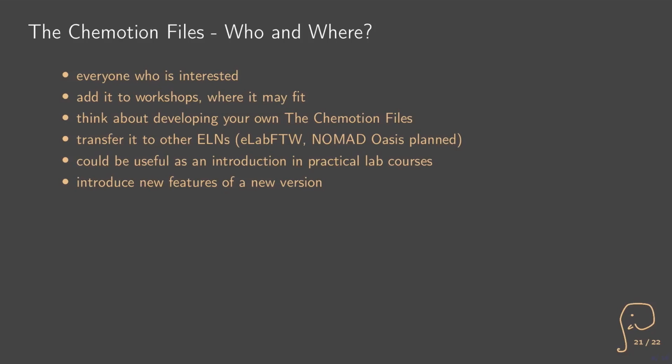What you could do instead is you say, okay, you have to do 10 syntheses. For the next semester, we cut down 1, you make 9, and the last one is actually an example which is already in the ELN, kind of the Chemotion files, right? All the data is there, and then they need to find a specific spectra or download the spectra, make some analysis or something like this, right? So that they don't need to put in the data and stay in the lab, but they just get familiar with how to work with data, how to work with the ELN. So the whole point of data literacy, basically, in this part, I think this could be very useful to users in this kind of capacity.